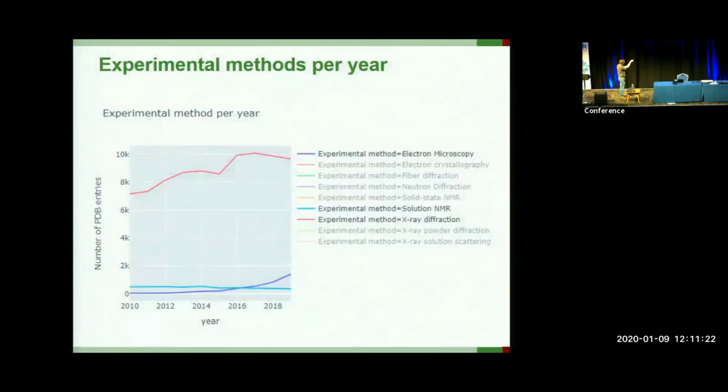So although EM has become the second experimental technique within the PDB, overtaking NMR a few years ago, now 4 years ago, it has still got a long way to catch up with X-ray, which forms the bulk of depositions that we have within the PDB. For all of those that you are scared that you haven't learnt EM yet.